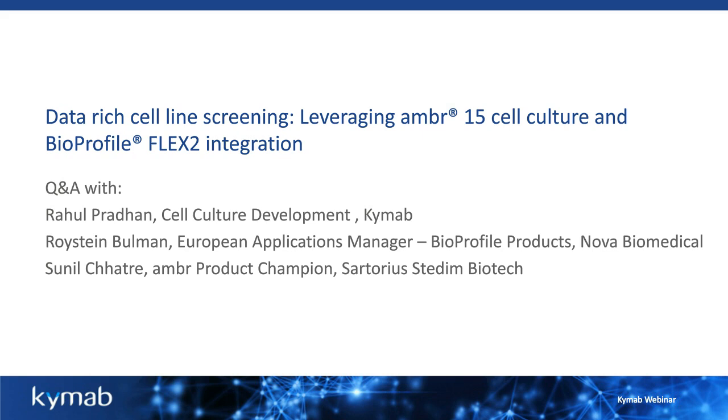Sure, thank you. I have a very interesting question here regarding the gas concentrations. So are gas measurements on the FLEX2 reliable considering the flow path from the ambr to the FLEX2?